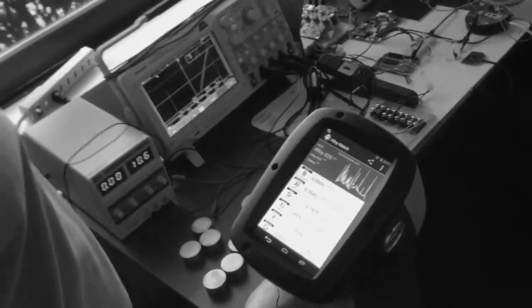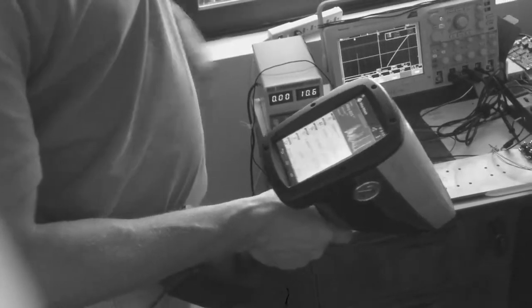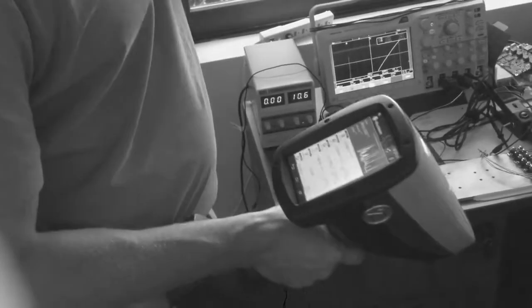We're ready. Okay. So today we're gonna look at a bunch of nickel alloys. We're gonna shoot through several very common nickels. I think what we'll see is that we'll get a good consistent ID after about 1 second. It's set up to do 2-second tests, so just for the chemistry.